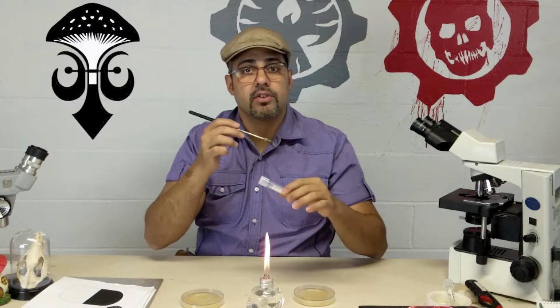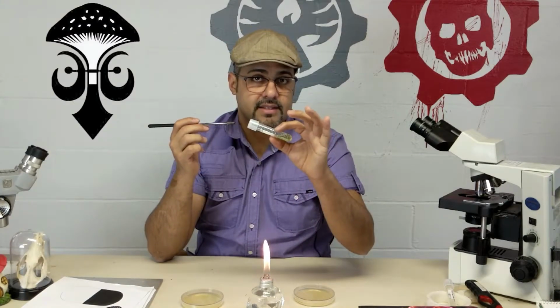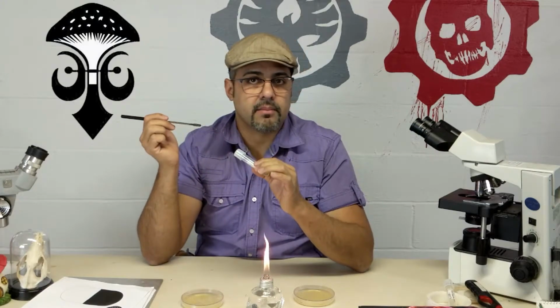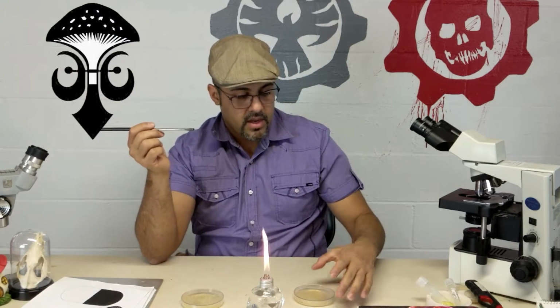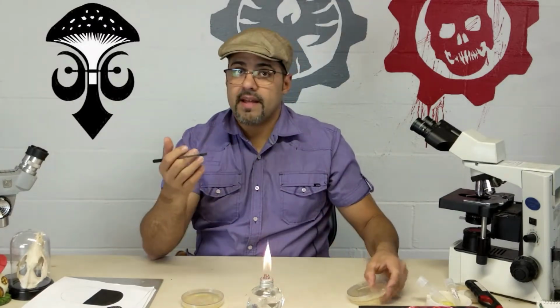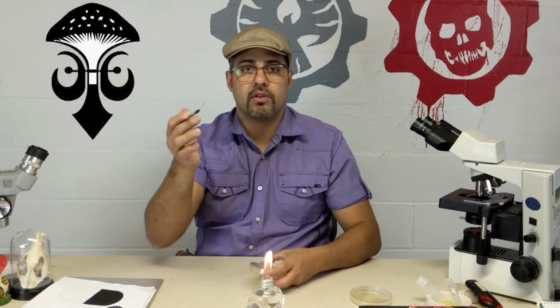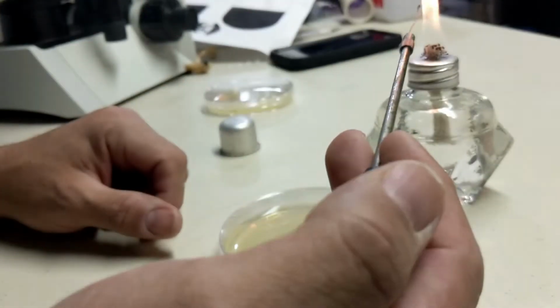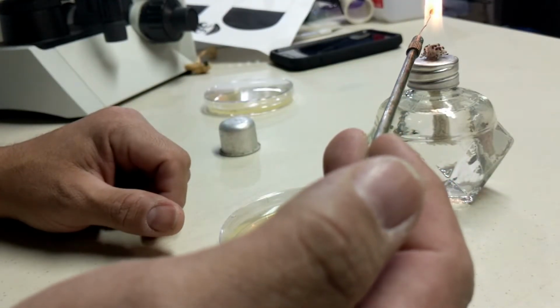If you're transferring to an agar slant, a tube that is slanted, then you can do a streak on the top. If you're going from any media to the plate, that's a different story, and I'm going to show you in the following video. So you always have to sterilize your loop, always.